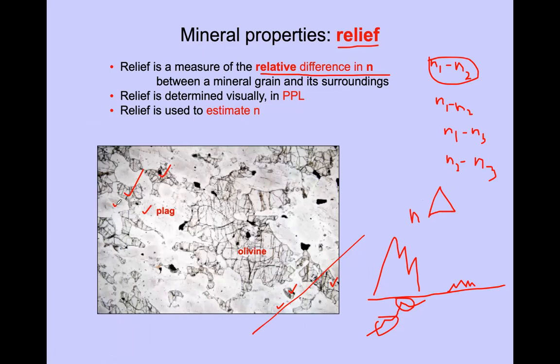So I think you can easily see this even in this photograph. This is a photomicrograph. That means a photograph taken from an optical microscope, right? So such things we call photomicrographs.